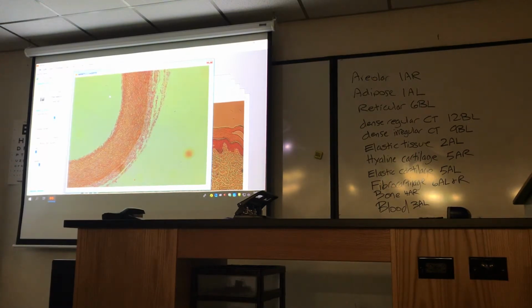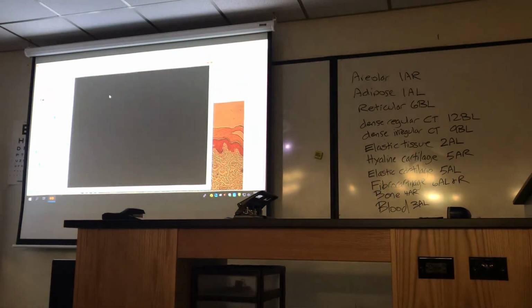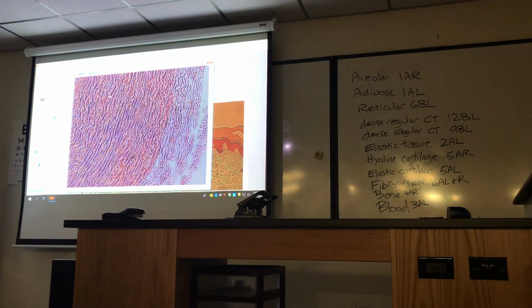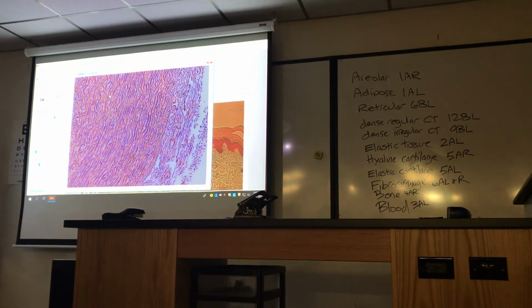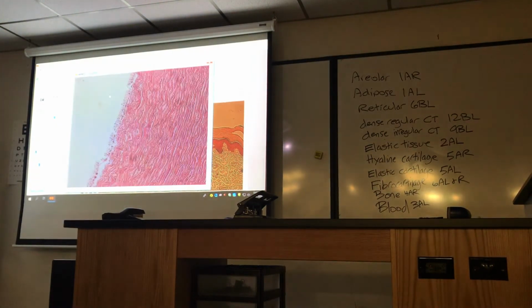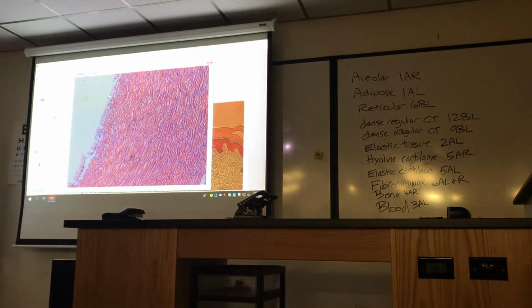We'll go to 400x. Let's see what I want here. I think the elastic content isn't enough. I really don't see any, actually. Let me get a different slide to look at.